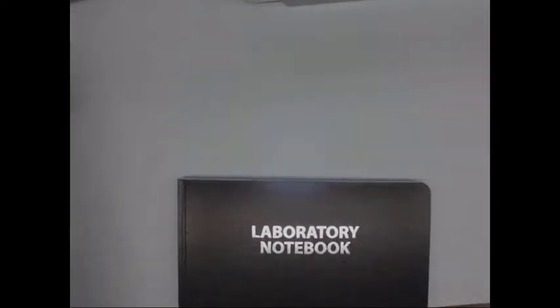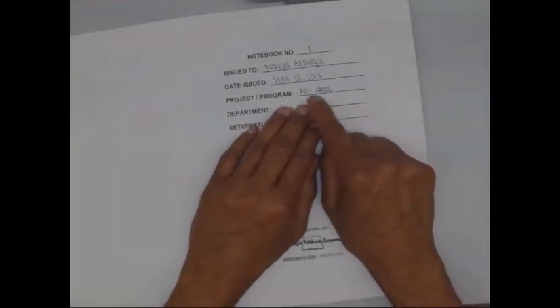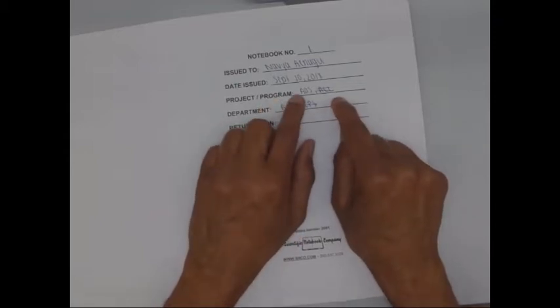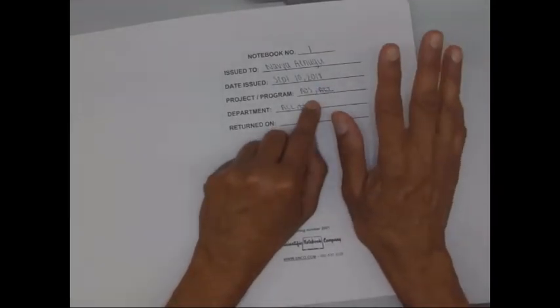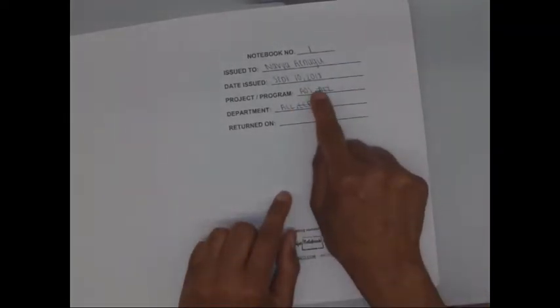Now, we will look at a real lab notebook which is used by someone else. See what are the correct and the wrong ones. There may be some errors there, like everybody can make a few errors. It's okay. So here, notebook 1, name, date. Unfortunately, the person wrote AOS, ACL, but it is only AOS or Academy of Science. And the second error the person made is that the person crossed it off twice. You never cross off an error twice, or scribble over it. You just cross it off once.